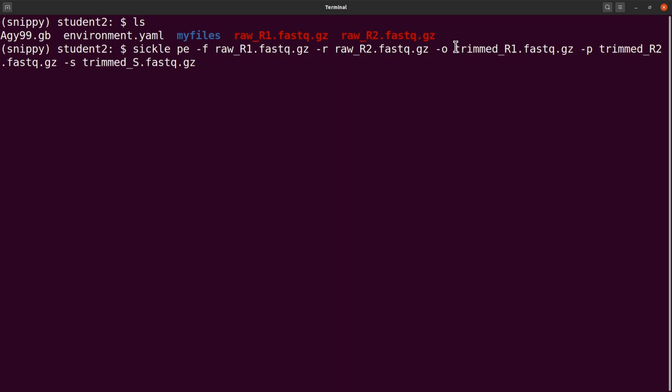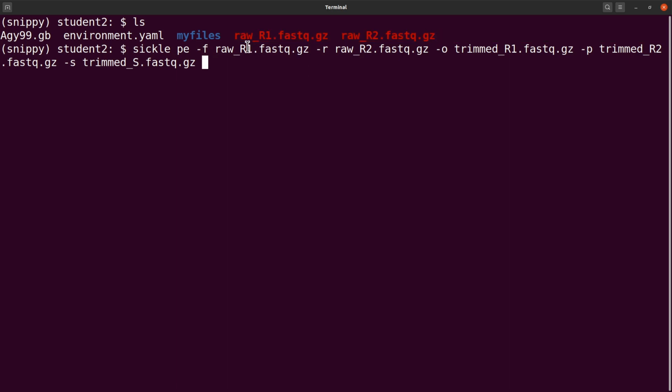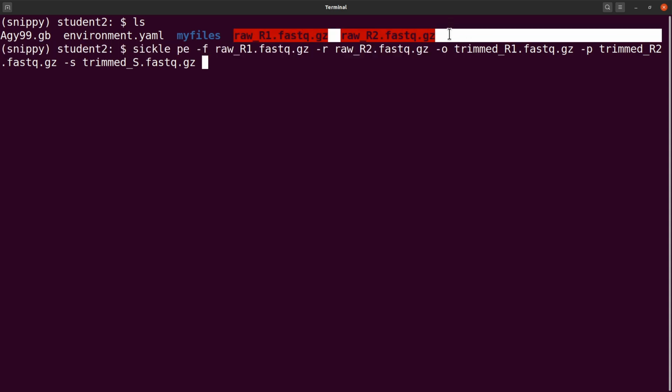So what I have here, if anyone comes to look at the files, the person will have an idea of what these files are because I have the name trim. So obviously this means that these reads have been trimmed. They are trimmed reads. Notice the names I gave for the reads, those we downloaded. I named them raw because we were going to do some processing on them, and that is why I named them this way. So these things help you to know the files and even track the stages of your analysis. So it's important to have this as part of your plans.